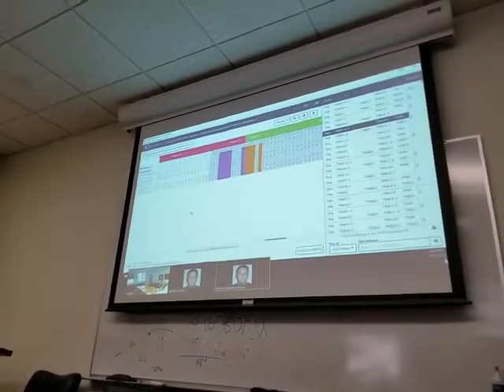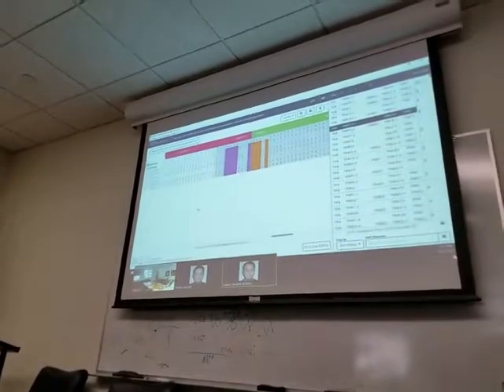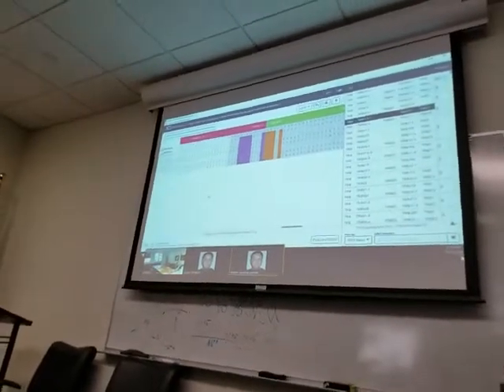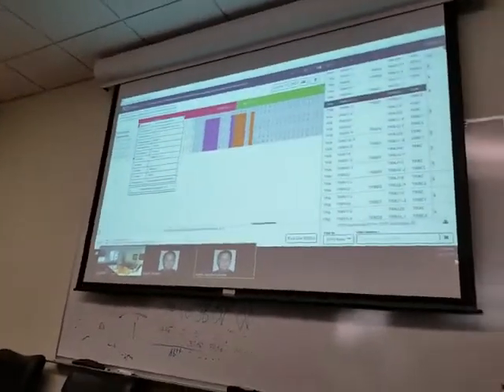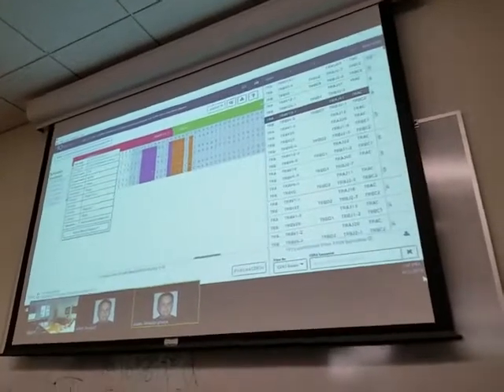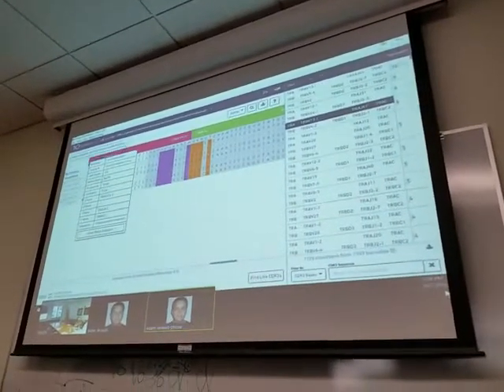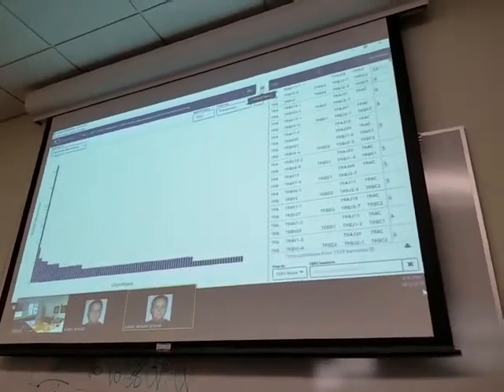Adam, I have a question. We have so many clonotypes. Is there a way that we can make hierarchical clusters for all these clonotypes? Make a circle instead of a traditional cluster. Is there a way that we can make a circle and then make clusters? Yeah, we don't have that view.